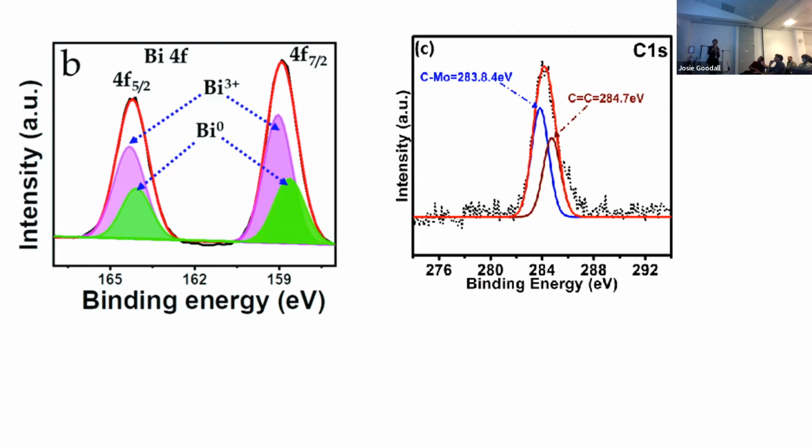For example, if you have an organic species where you have a carbon peak fit, a carboxyl environment, what about the oxygen? Do you see a similar amount of oxygen to account for that carboxyl? Is that one of the things to tally together? So I think in things like Rietveld refinement and XAS analysis, because we have that atomistic model, we're much more constrained on the models we can actually make.